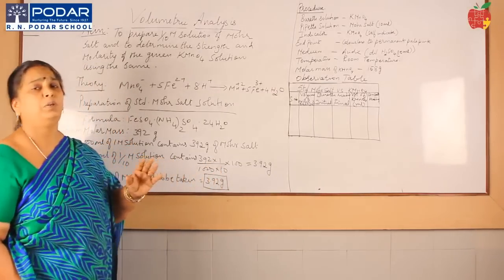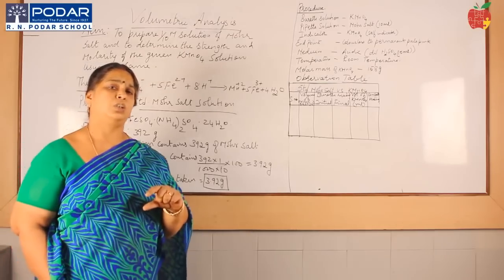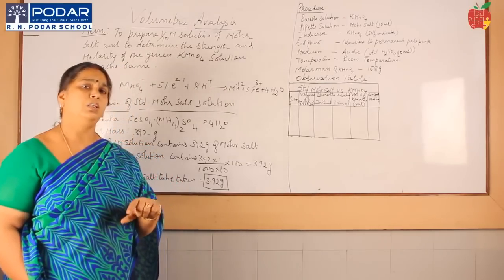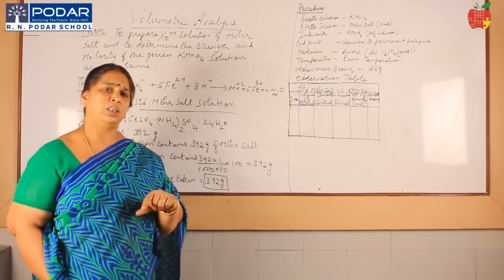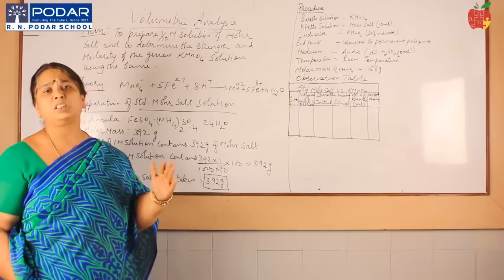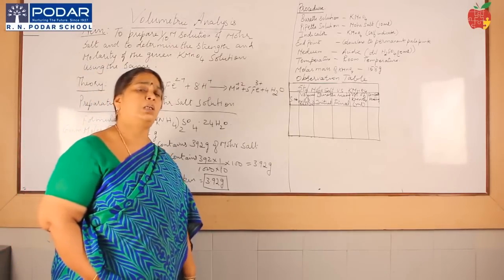You are going to prepare the Mohr's salt solution, which is called the standard solution. A standard solution is the one whose molarity or concentration is known to us and which does not change its concentration when kept for some time. We call these kinds of solutions primary standards.